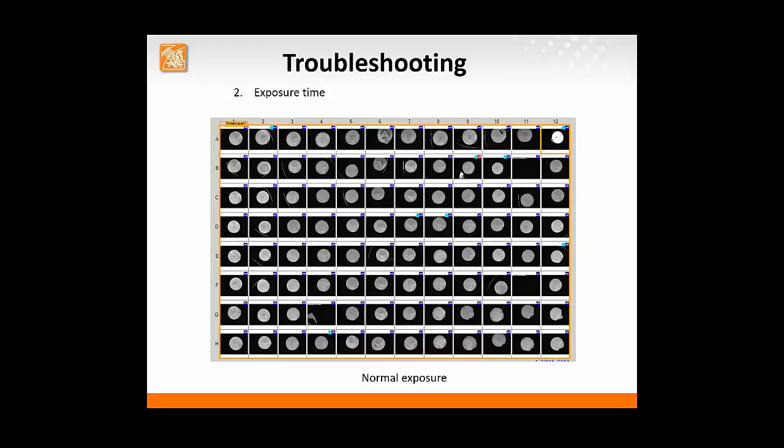The second set of problems is related to setting up the exposure time, and exposures can vary dramatically in these samples because the labeling efficiency can be different for different proteins, and also different conditions can change the fluorescence. And even within each drop, fluorescence can change dramatically due to the presence of precipitated protein and some other aggregates. Therefore, this parameter is user selectable, and users should look at several droplets and choose a proper exposure time.